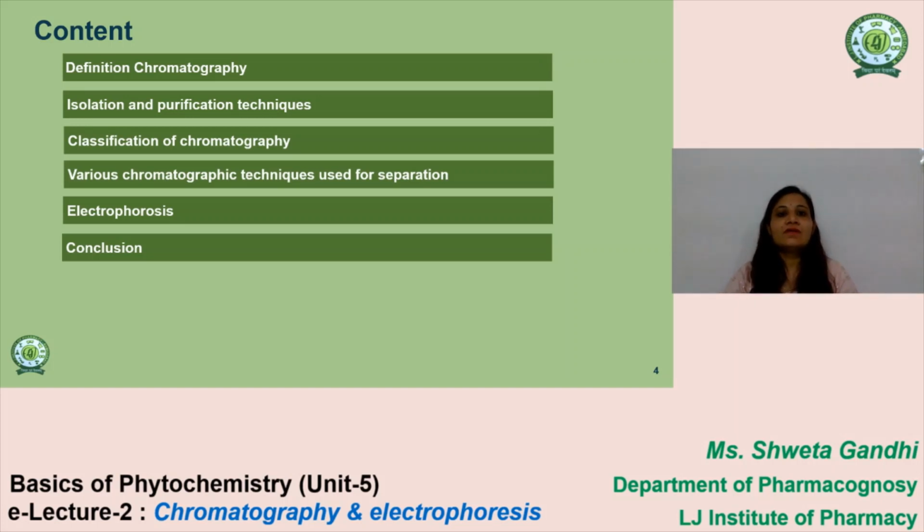First, we'll cover what is chromatography. What do you mean by chromatography? How does chromatography work in the separation and identification of the crude drug? Isolation and purification techniques: what is the importance and role of isolation and purification techniques?